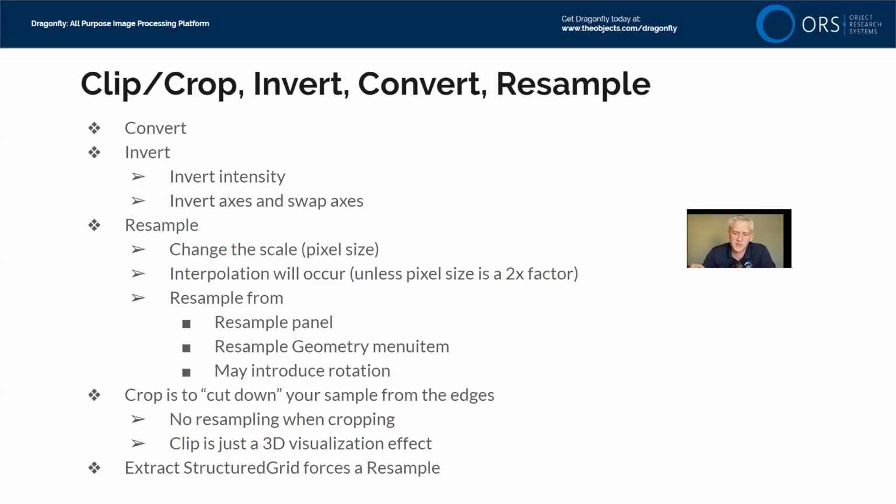We'll also look at invert, and in this case we're going to talk about two different definitions of invert. We'll talk about inverting the intensity of the images, but we'll also talk about swapping axes or changing the orientation of the image in your workspace.